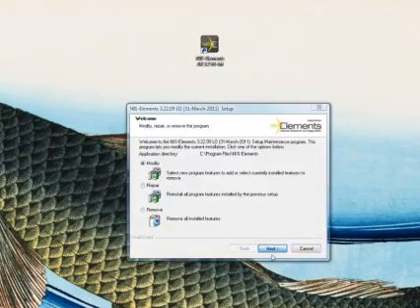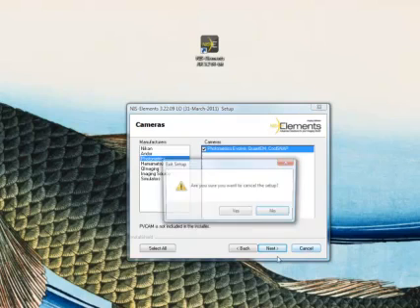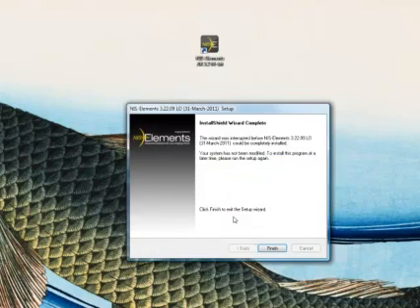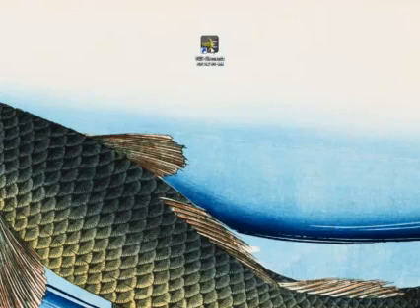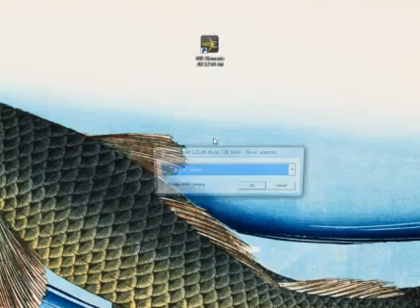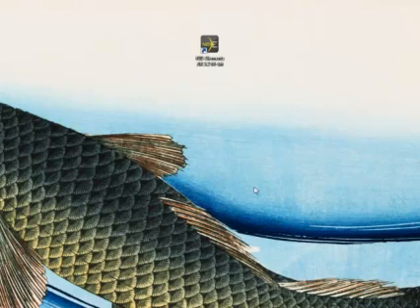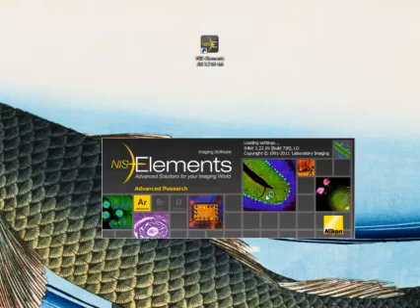And it's from here that I can just step through Modify, Next, Next, and select Photometrics and make sure this is ticked. Okay, I'm going to cancel that because I'm already done. And now I can just start the software. While this loads up, I now get to select my camera, Roper Scientific for Photometrics. And we should just be launching. Here we are, the splash screen.